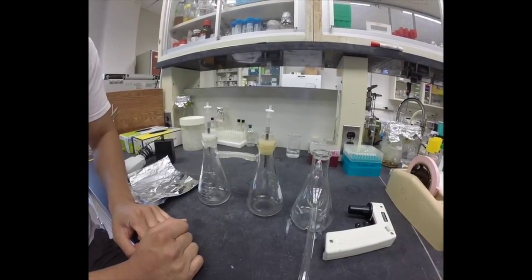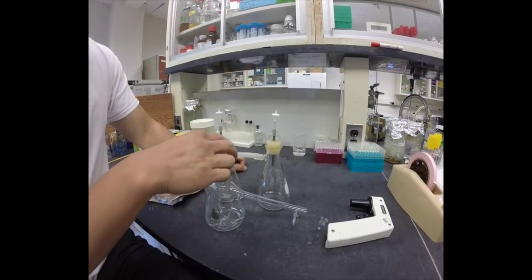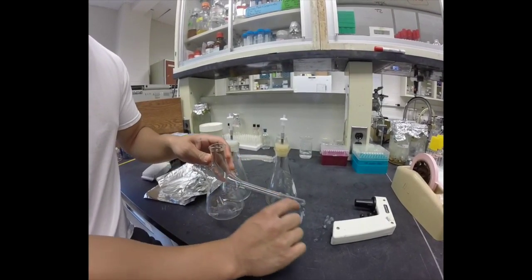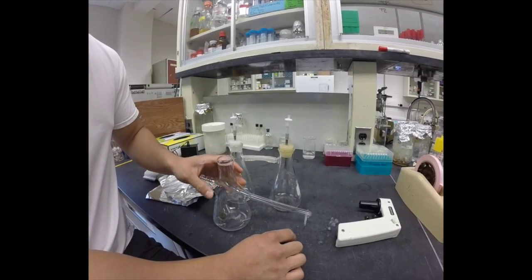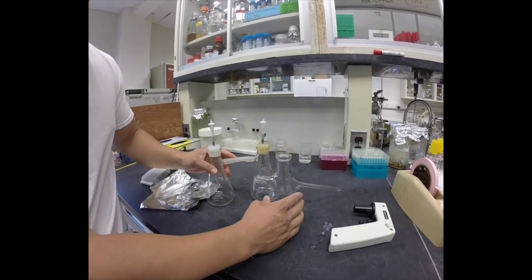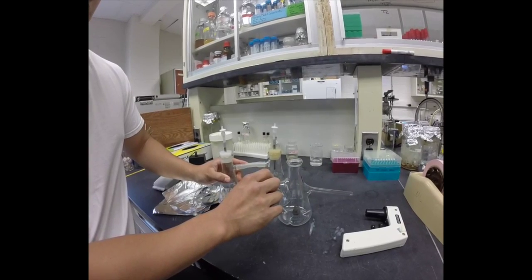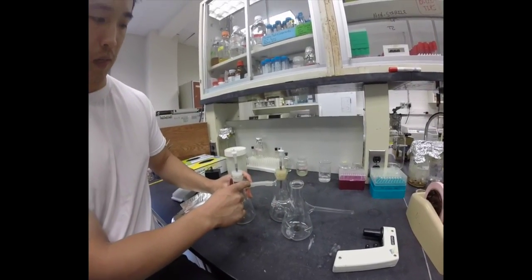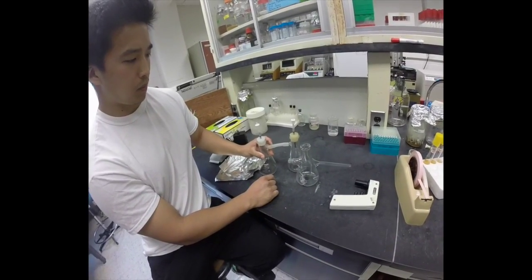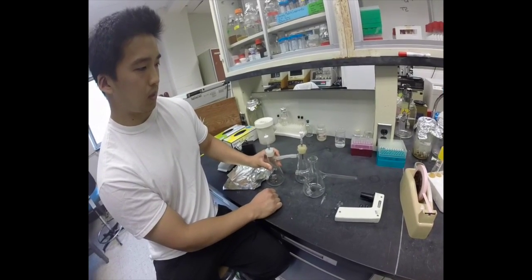Together. If you do need to keep track of the growth data, you can use this flask. This is a Nephelo flask or a Klett flask, and you can just stick this stem into a spectrophotometer and measure the OD that way. You'll need a little bit bigger tubing here. It's pretty difficult to get it onto this opening while being tight enough to fit onto this vacuum flask. So you might need some zip ties or something like that, but it generally works well.